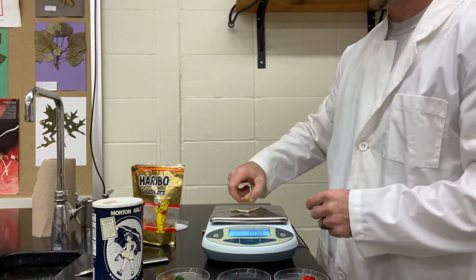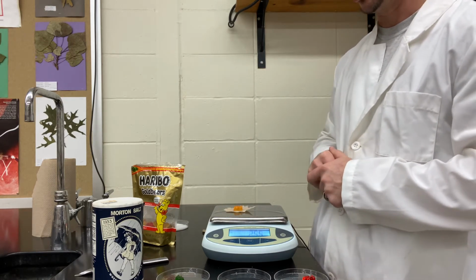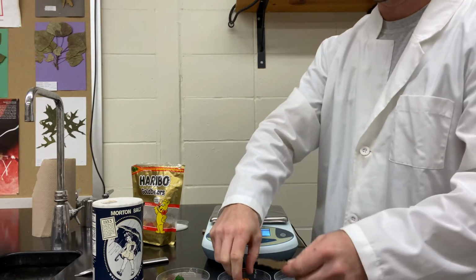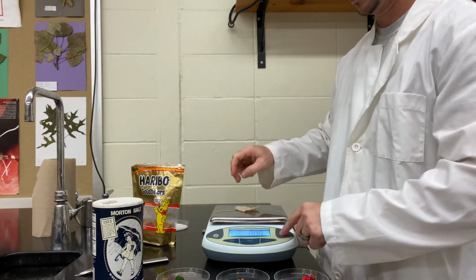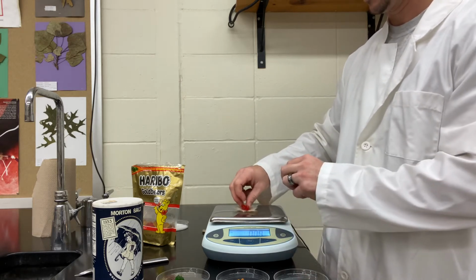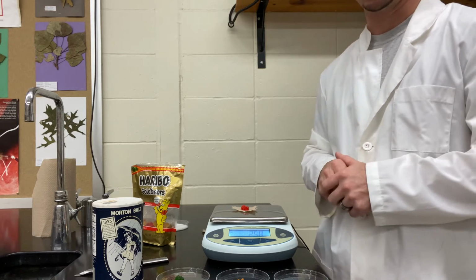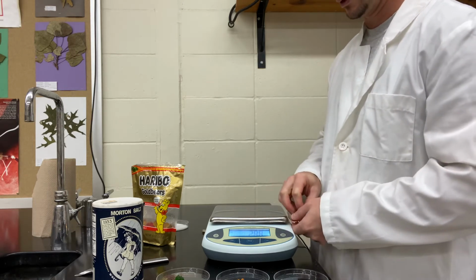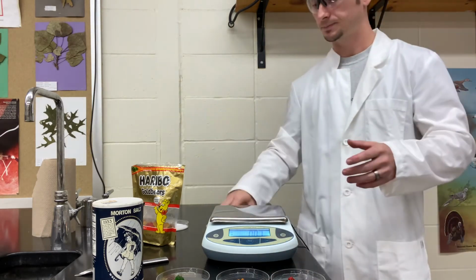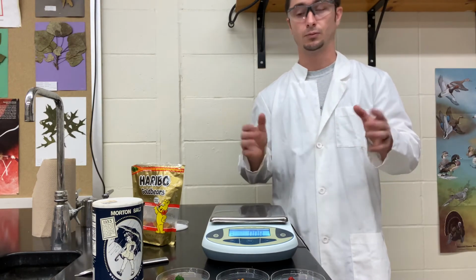The orange one, he is a whopping 2.55 grams. And then the red one, he is 2.58 grams. So that is the data that you need to record initially to figure out their starting weights. Because what we're going to do is put them in these different osmotic states and hopefully see a change in their weight, whether that's an increase, decrease, or stay the exact same. We're going to find out.